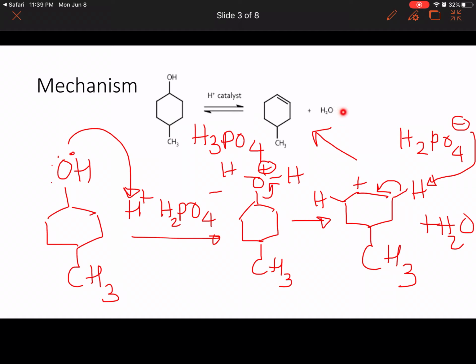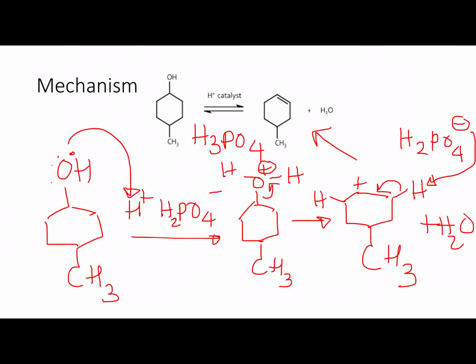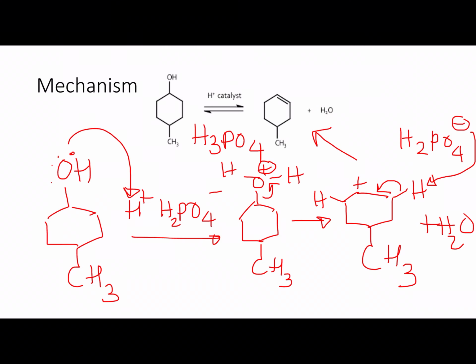In order to achieve that, as we form the product, instead of keeping the product in the vessel itself, we're going to distill it off of the reaction mixture. So the alkene and the water will be removed, and according to Le Chatelier's principle, as the product is being removed, the forward reaction will take place to compensate for the loss of the products.